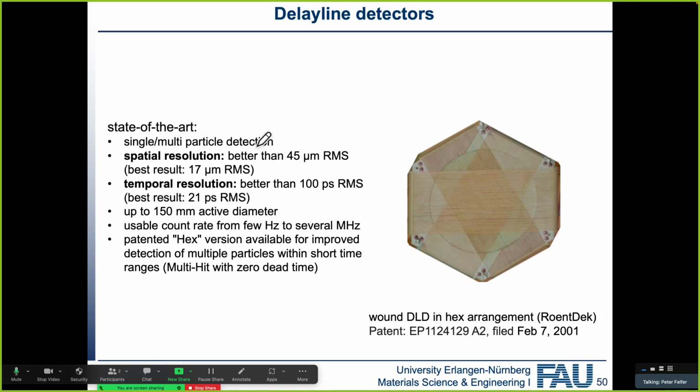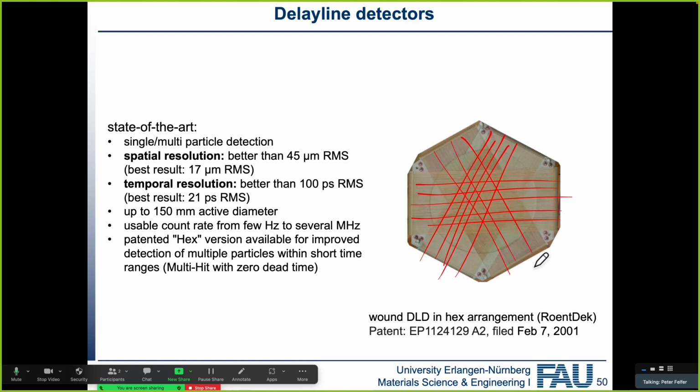Typically in atom probe, very often what we have is also a third one, and that's what you're going to see downstairs. So we have 3, so that you have one redundant delay line, which is great if we have multiple ions impacting and we need to figure out where the multiple ions hit.